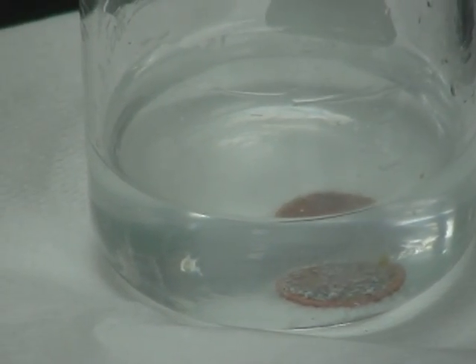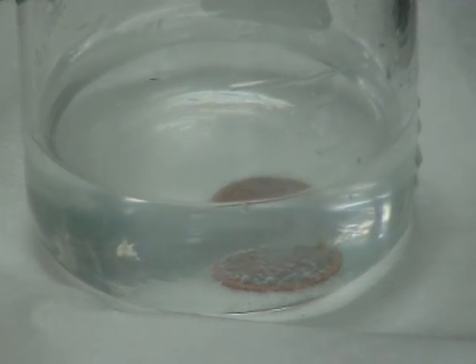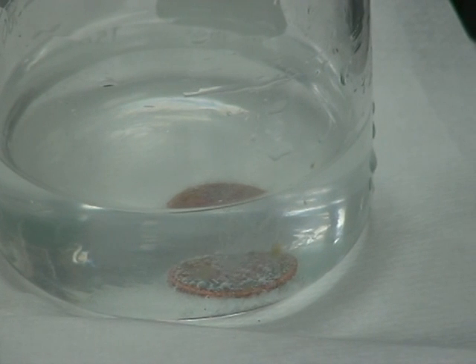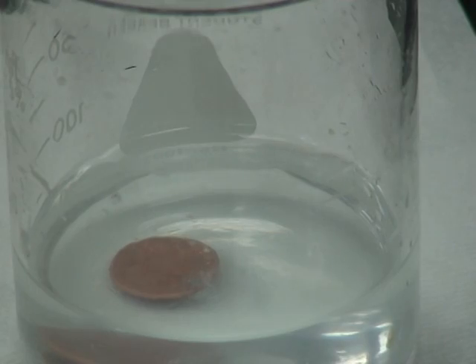Those bubbles, again, will indicate that a gas is being formed, which means that's a chemical change. In fact, if we leave this long enough, you'll start seeing copper coming out of that. So there's definitely something new being produced in there. Let's come back to that in a minute.